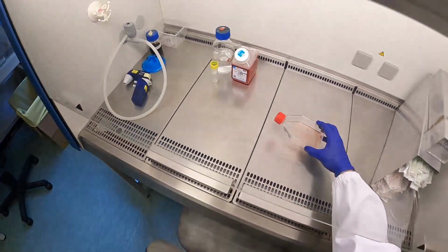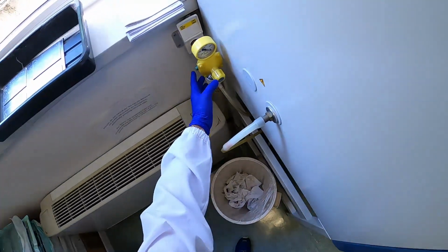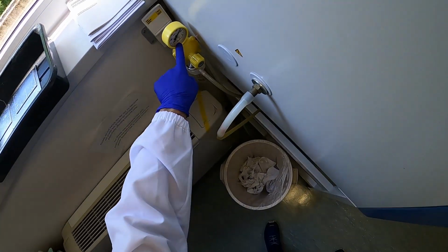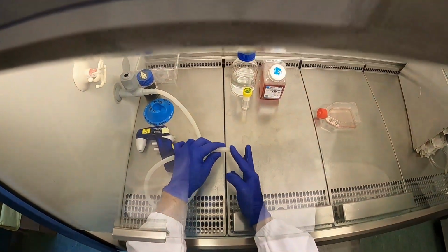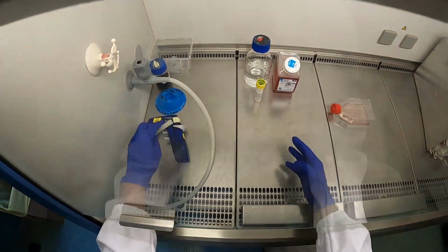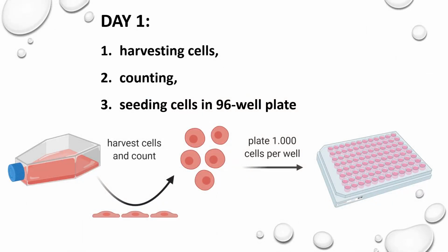So let's put the flask in the flow hood and switch on the vacuum, which you'll need to aspirate the medium and aspirate the PBS washes. You see there's vacuum there, and there's a nice way of checking it with your finger. So we're now ready to get the cells and start working with them. First thing we need to do is put on some gloves, and then we take the flask out of the incubator. We'll remove the medium and wash the cells twice with some PBS.